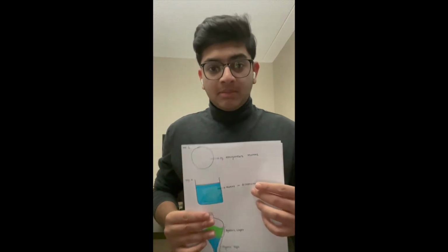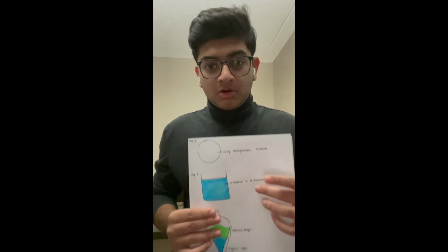purification. So the first step was solvent selection. Now, an appropriate solvent would be the one which would dissolve all 3 substances very well and would stay immiscible in water. So according to me, the best solvent for my 3 compounds was dichloromethane.